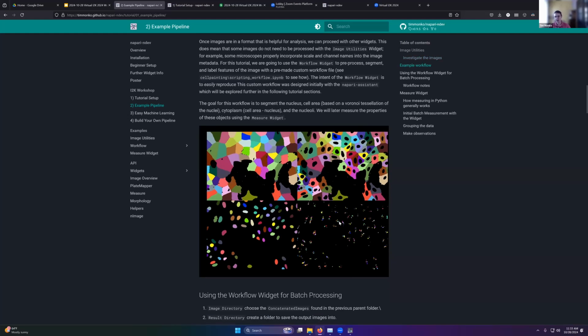And then we can ask a question, for example, are these nucleoli segmentations inside the nucleus or inside the cytoplasm? Are mitochondria inside the cytoplasm, inside the nucleus, right? There's a lot of the work that CellProfiler is doing. So if you're familiar with CellProfiler, this is a very different take on how to approach that high content screening type analysis or high throughput analysis.